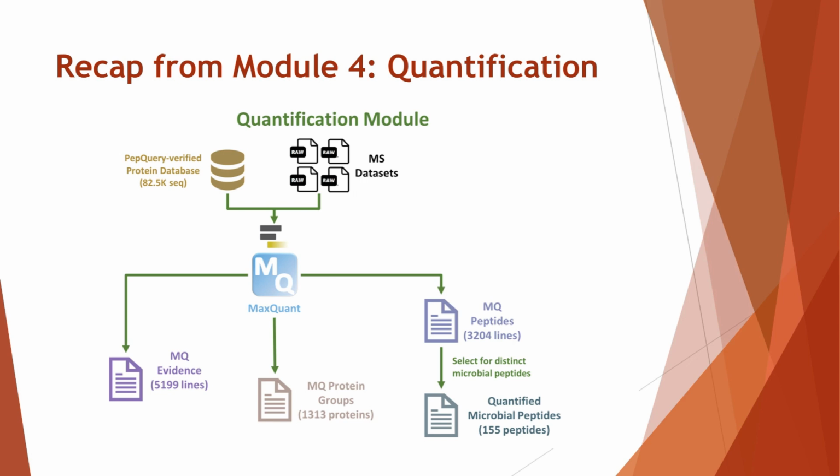Here is the recap of the quantification module. We used MaxQuant to quantify verified peptides and selected for distinct microbial peptides from the peptides file. We also generated evidence and protein group files. These files will come into play for this module.